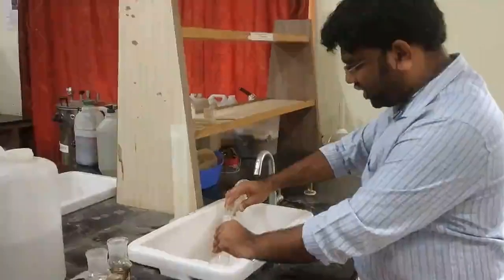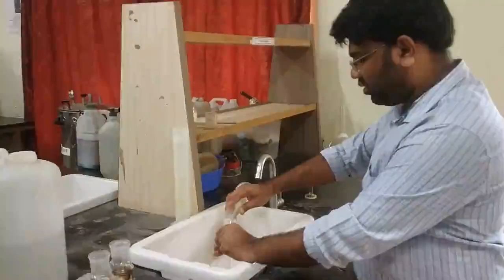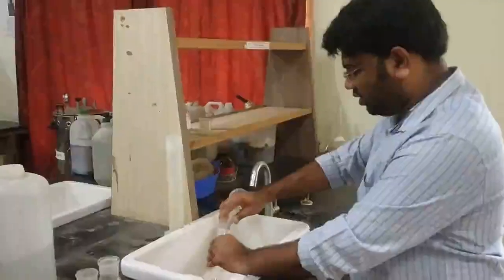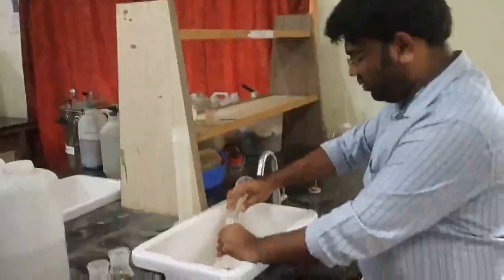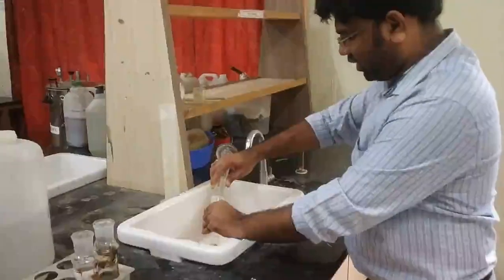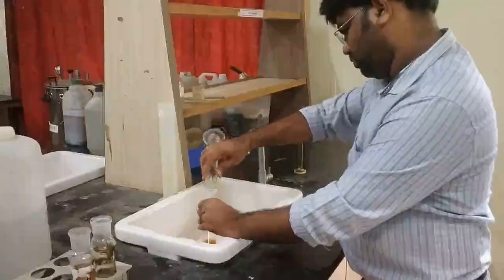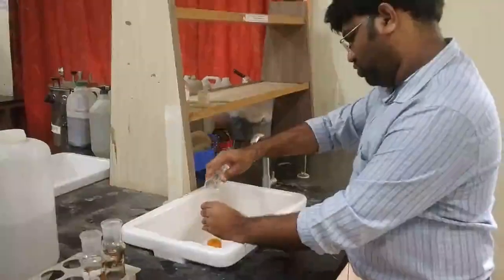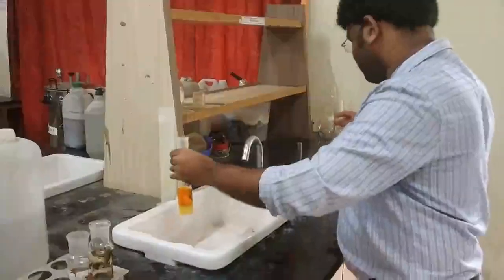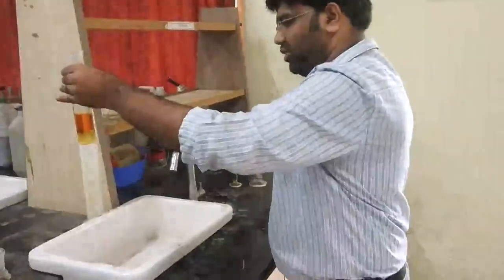No stirring, nothing is to be done, right? If you do stirring, the reaction will take a violent turn, and the liquid will come outside. So you can see the change that has happened.